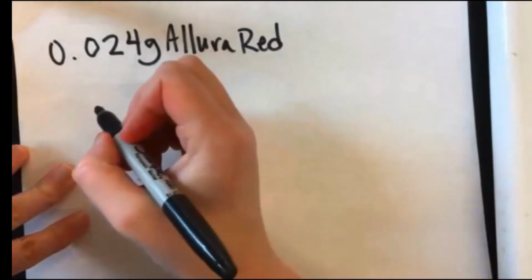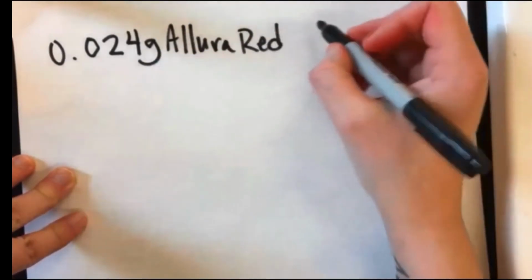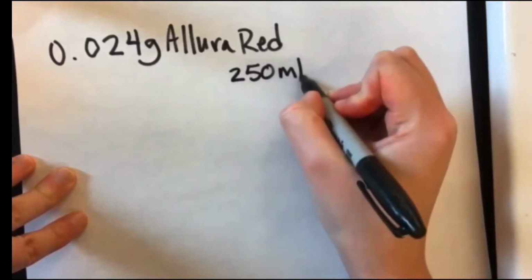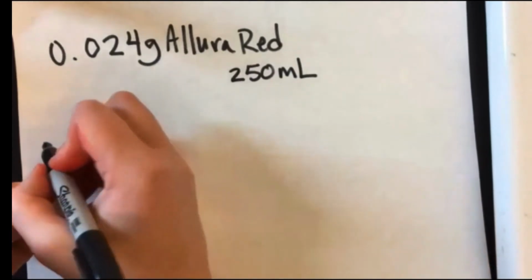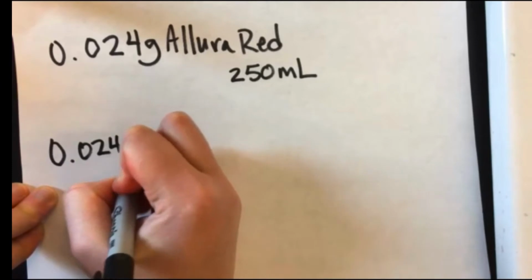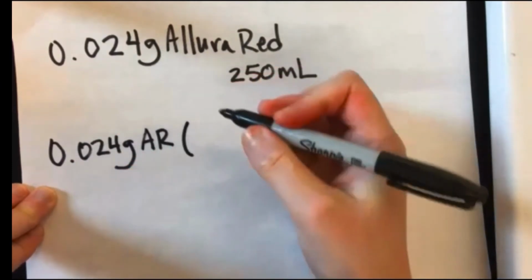And then we made 250 milliliters of it. So we will start with the grams.